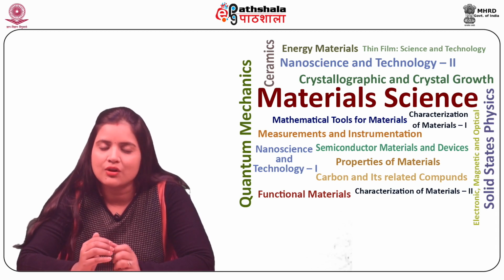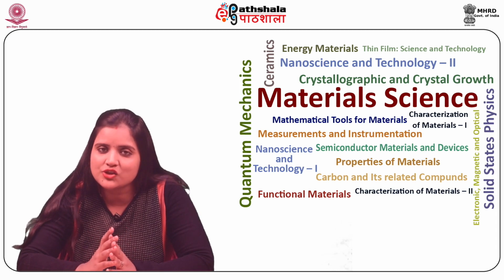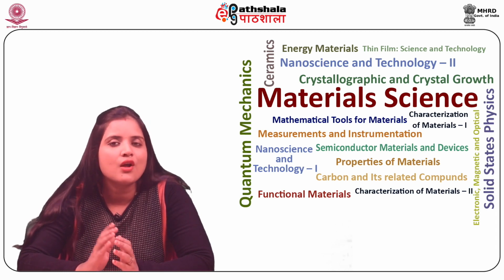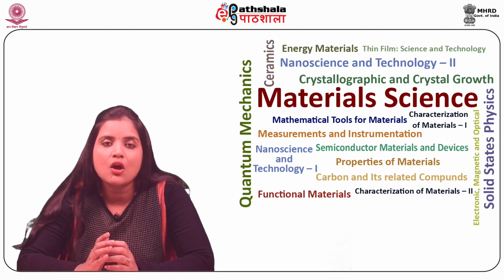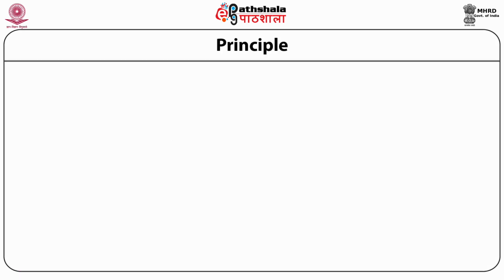Proper selection of fluorochrome, filters, and illuminator is imperative for efficient working of fluorescence microscopes for particular applications and for determining the quality of fluorescence signals. Let us discuss the principle of fluorescence microscopy.